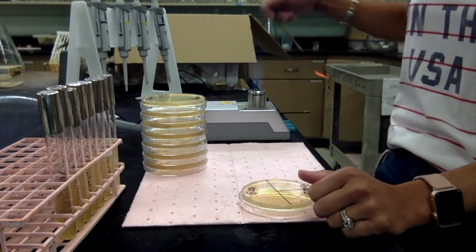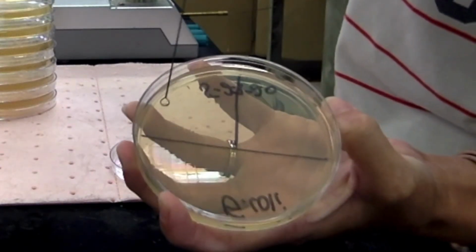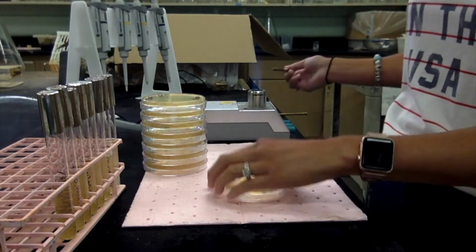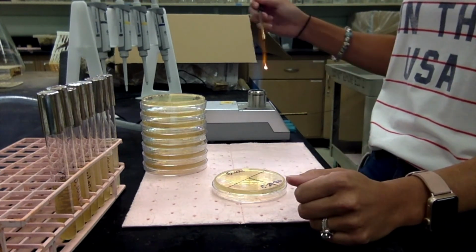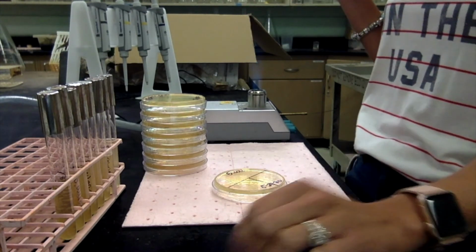And remember, we're not stabbing into the agar, we're gliding on top. Then start in quadrant 2, then stay in quadrant 3. Now, if you stab a little bit like I did there because I was at a weird angle, it's okay. The bacteria will be fine, but you just don't want to do that a whole bunch. And just make sure you flame your loop after. And that's how you make a streak plate.